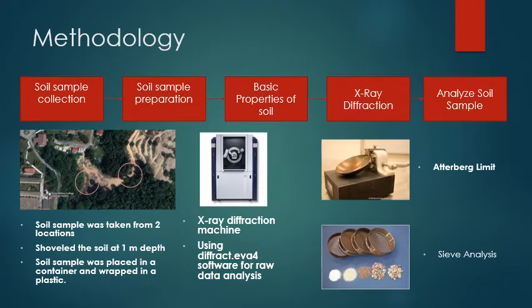Methodology. I will be going through it one by one: soil sample collection and soil sample preparation, basic properties of soil, X-ray diffraction, and analysis of the soil sample. The soil sample was taken from two locations, by shoveling the soil at 1 meter depth. The soil sample was placed in a container and wrapped in plastic to prevent moisture from evaporating.